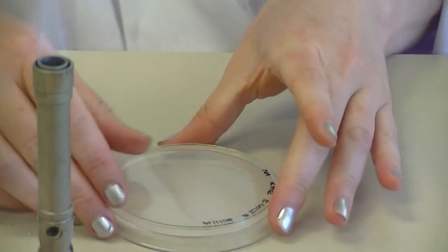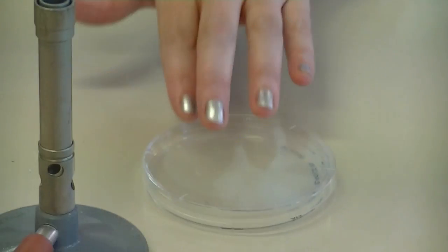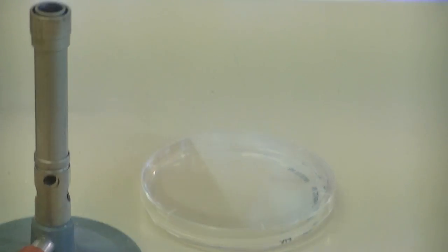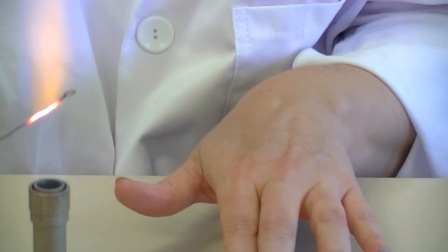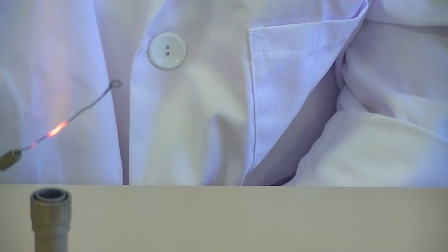Once again, flip your plate up the correct way — this is your starting point. You need to re-sterilise your loop to make sure it's ready to collect some of the broth culture.